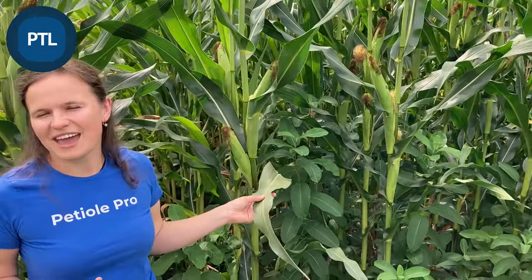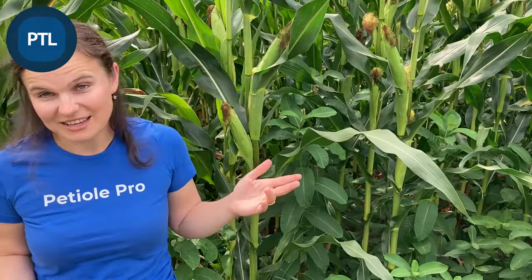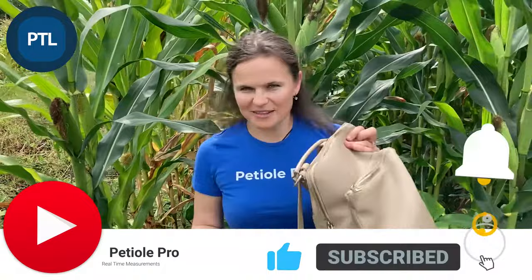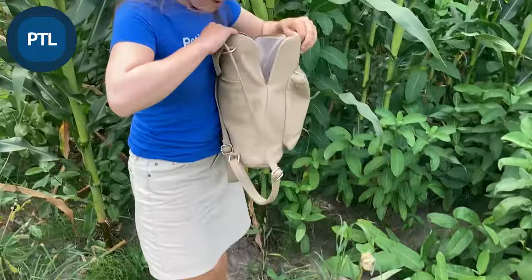I'll show you with all the hand-on equipment I have how to do it very quickly and efficiently. Another question we get is about measuring leaf area of quite long leaves — for example, this corn has a very long leaf. I have this backpack, and this is actually everything I have. I also have this glass to keep my phone in safe conditions.